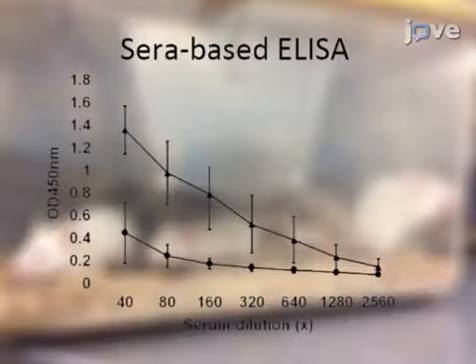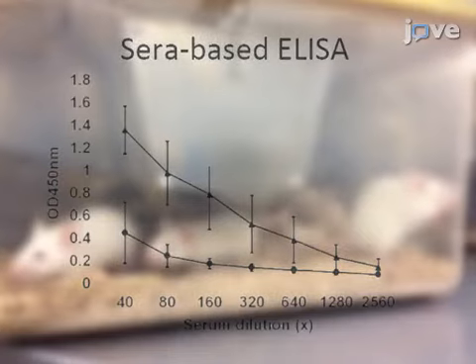By using the Antigen Capsid-Incorporation strategy, multiple cloning steps are used to construct the modified plasmid Ad5-R1-KWAS-HVR5-His.